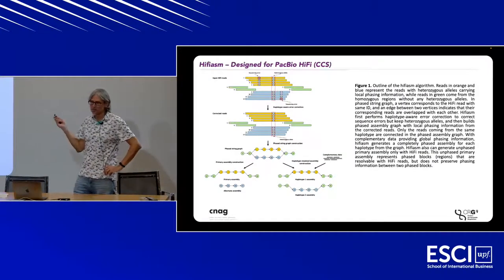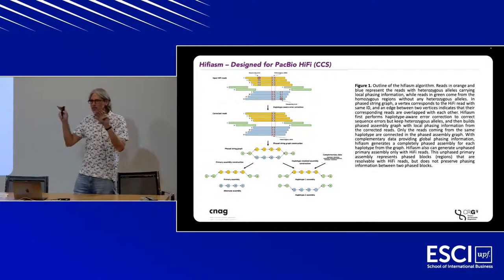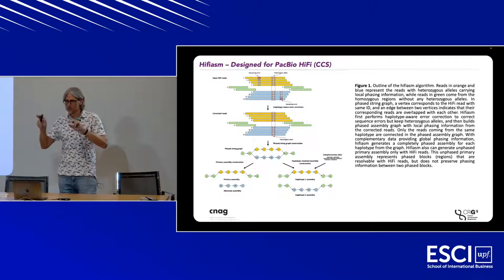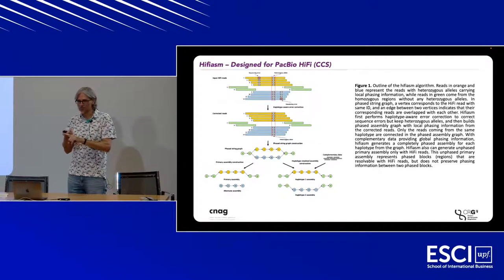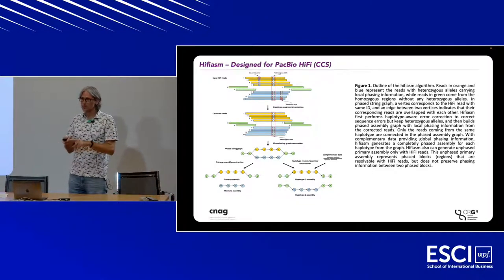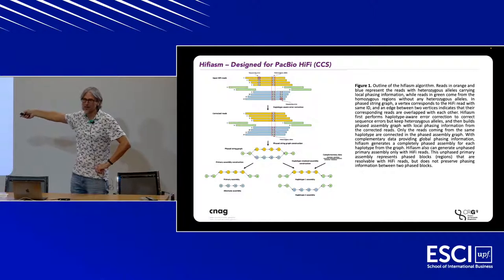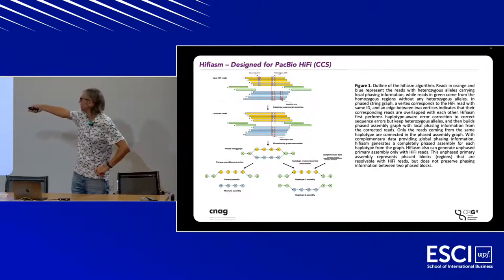And the most popular genome assembler right now out there is Hifiasm, or HiFi Assembly, right? This is written by Heng Li's group. So Heng Li is one of these bioinformatics gurus out there. His group works on BWA, which is a short read aligner, Minimap2, a long read aligner, assembly algorithms like miniasm for ONT reads, Hifiasm in this case. And everyone is using this now, if you have HiFi data, which we don't yet.